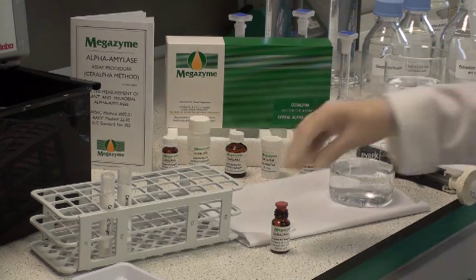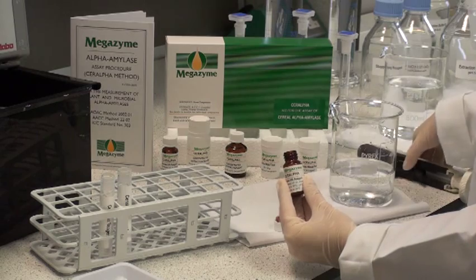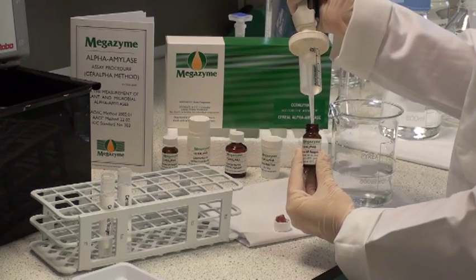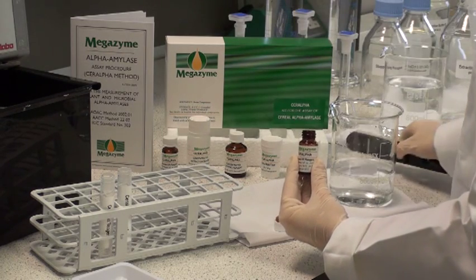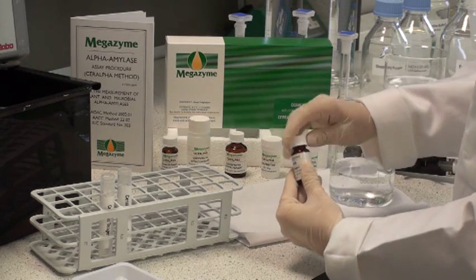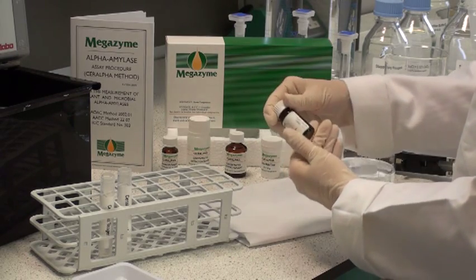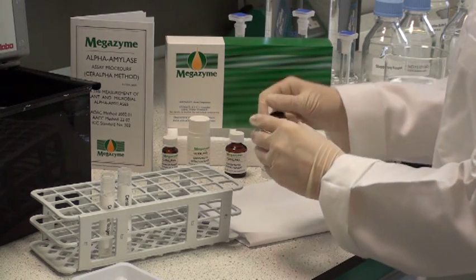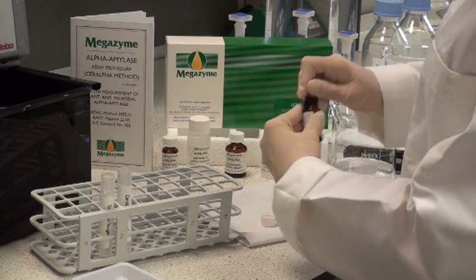The SIR-alpha reagent is prepared by dissolving the contents of one of the vials in 10ml of water that has been boiled and cooled to room temperature. The bottle is recapped, the contents are mixed thoroughly, checking to make sure that all of the substrate has dissolved. This is then transferred to two polypropylene tubes for storage at minus 20 degrees centigrade between use.